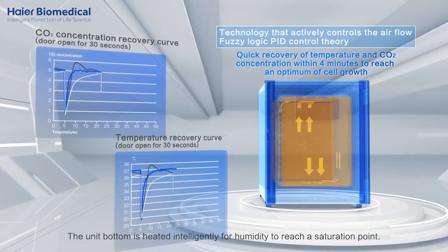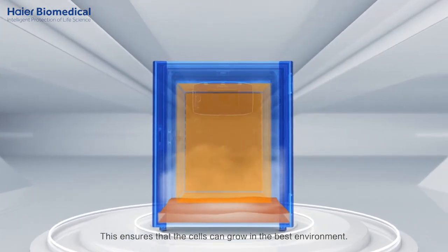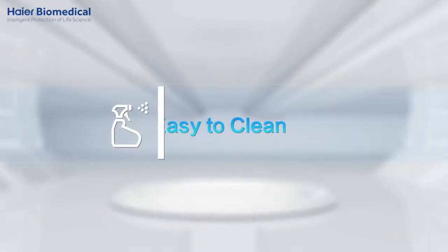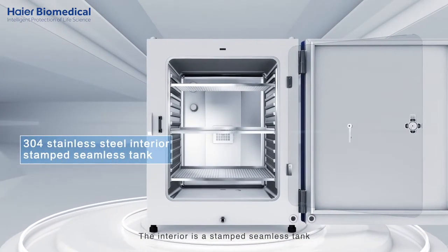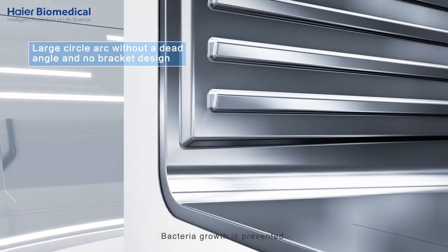The unit bottom is heated intelligently for humidity to reach a saturation point, ensuring that the cells can grow in the best environment. The interior is a stamped, seamless tank. It is easy to clean and bacteria growth is prevented.